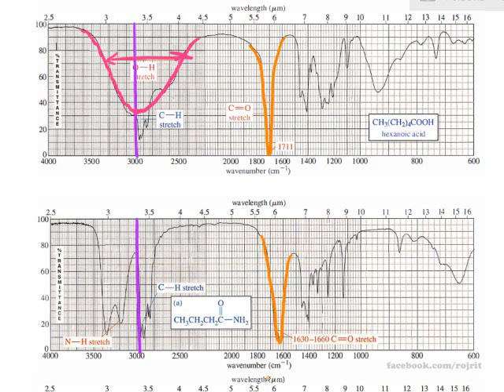And for NH here, you have two spikes, indicating the primary amine, right? But this is not an amine because the absorption is very strong. This is very polar. It's similar to an alcohol actually, but it has two peaks. Why? This means that the amide has very high polarity of NH compared with the amine.